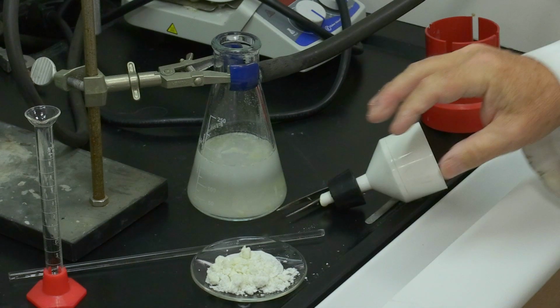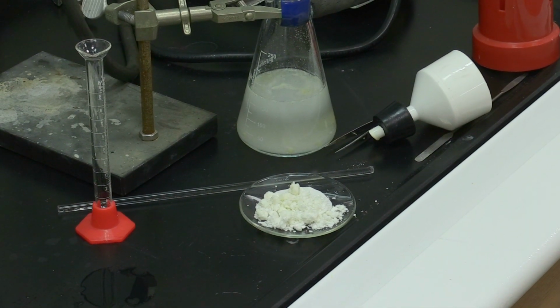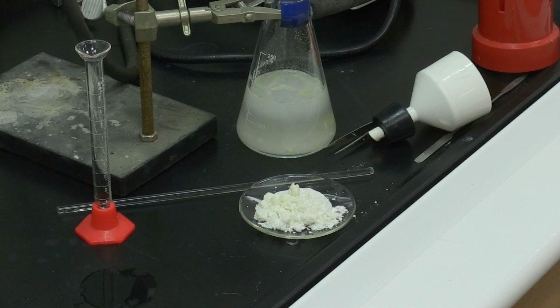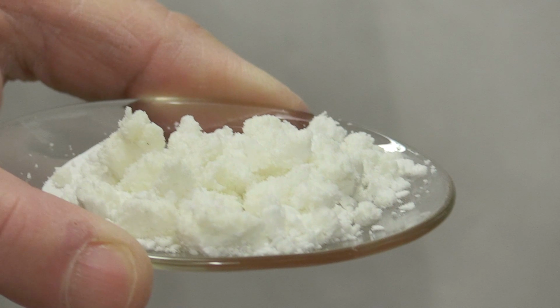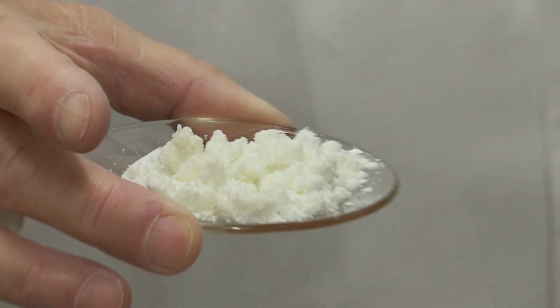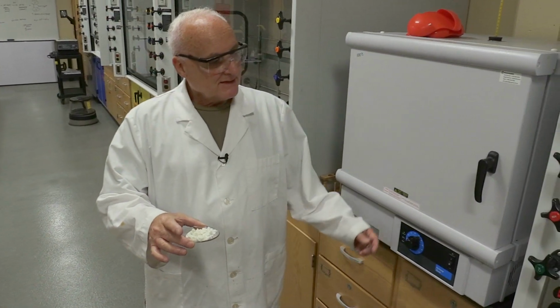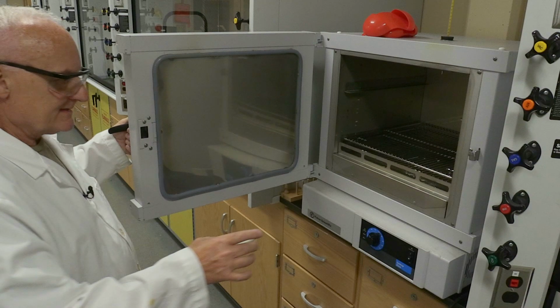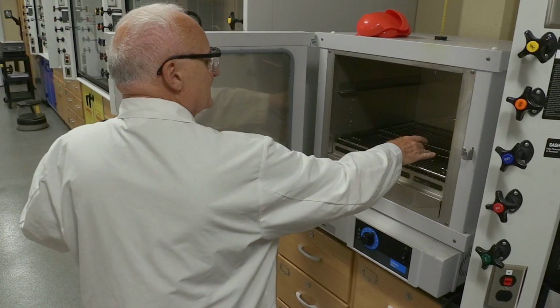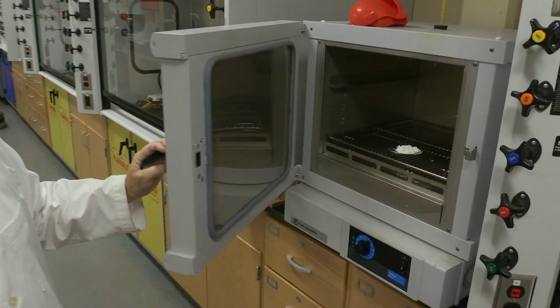Now we want to dry this in the oven and then weigh it and come up with our mass and our yield. So this is the collected product that we obtained from part B. We let it dry under vacuum filtration for several minutes, and now we're going to put it into an oven at 100 degrees C to hopefully get it dry enough to get our mass, and then we'll calculate our percent yield.